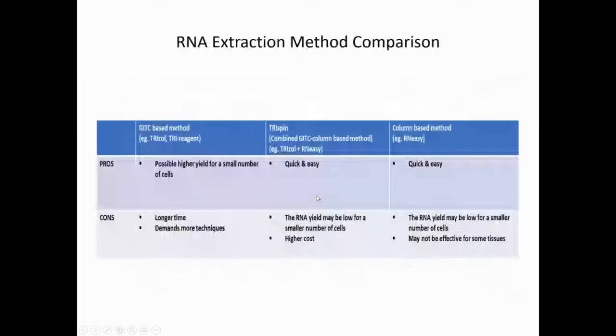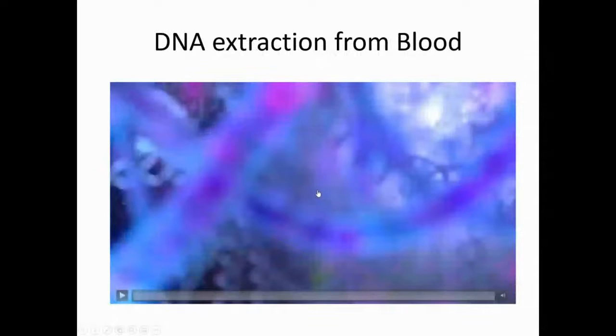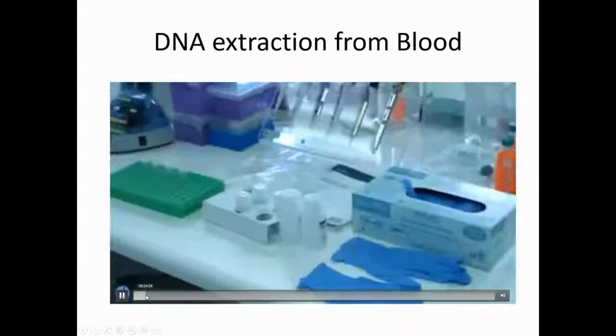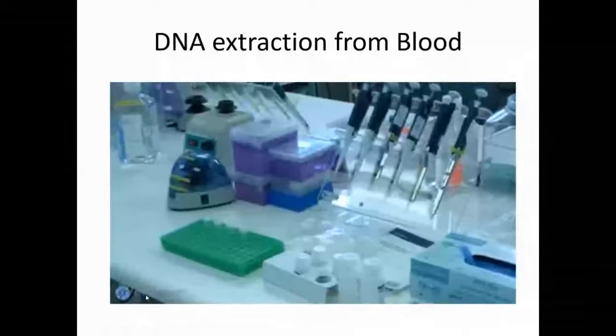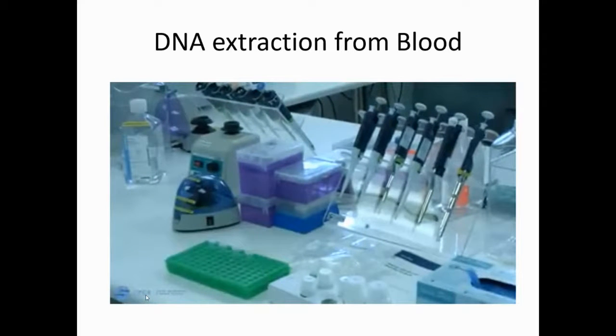All right, and now we will watch some video about how to purify. So, for example, here is DNA extraction from the blood. Okay. Carried out in duplicate on a single blood sample. Please note that blood sample collection should always be performed by a phlebotomist.